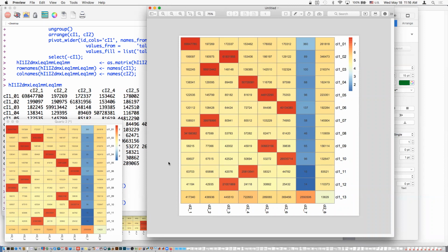But here, with a unique dual, if you change just I1 or just I2, you'll never land on another declared pair because you've made the unique pairing. And so that's really good. With unique duals, if either I1 or I2 is the wrong label, they always go into reject, and won't go into a sample schema.